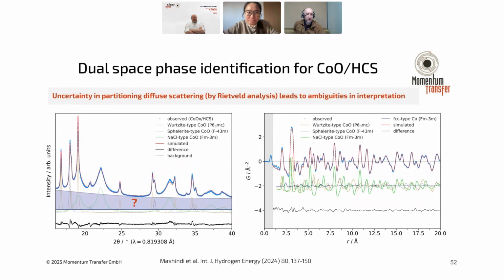So you have lots of overlapping, broadly varying signals, and it's very difficult to accurately partition out these components. Okay, so if I have a very slowly varying signal from 1 nanometer particles present, I don't know that that's not getting subsumed into my baseline estimation.